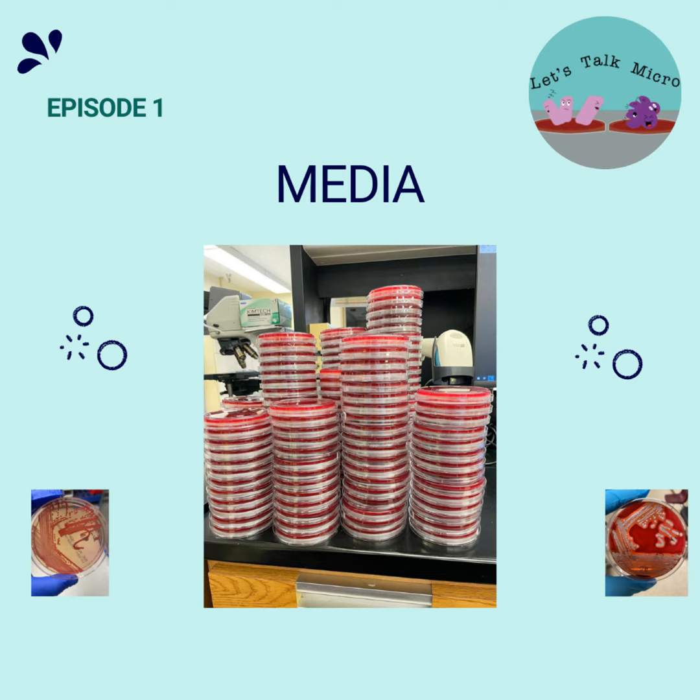And then once we have the sample on the plates, what do we do with it? Do we leave it like that? So the answer is no. By adding the sample, we inoculated it, and now we have to streak it. So with a loop, we streak, and there are two types of streaking. You have your isolation streaking, what they call the 4 quadrant. A lot of hospitals do the 3 quadrant. And then you have the quantitation streaking, which is the one that you use for your urine cultures. That's also for some quantitative bronch washes.